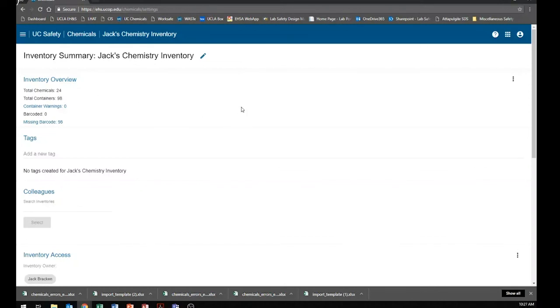So that's going to conclude this particular tutorial. In the upcoming weeks, expect more, and if you go to the chemical inventory page within our website, you can find all of these tutorials as well as other information and known issues to help you when working with UC Chemicals.